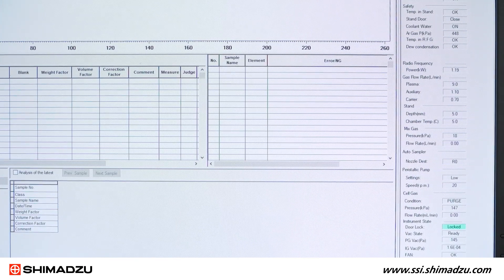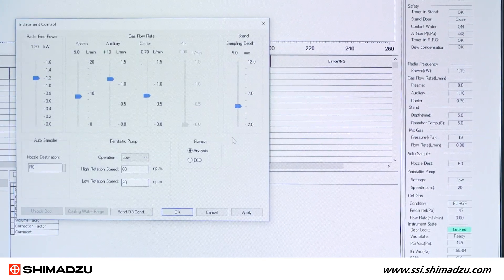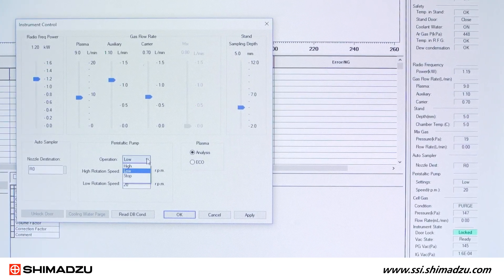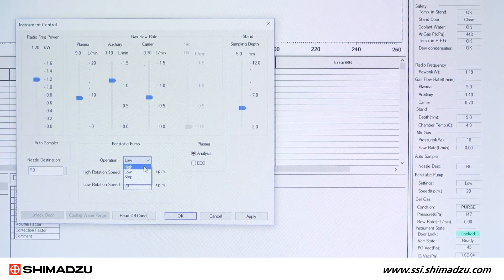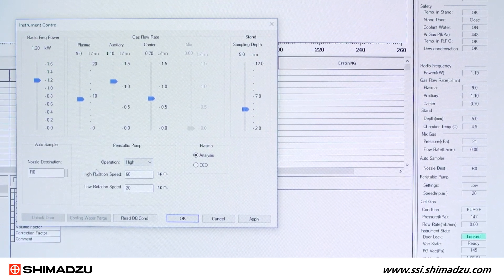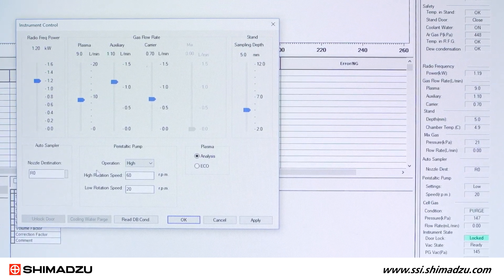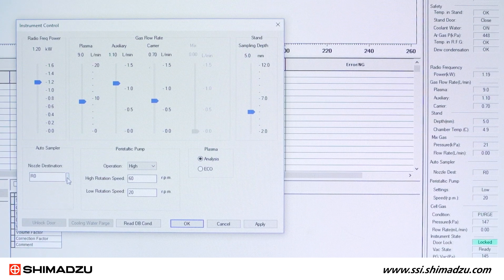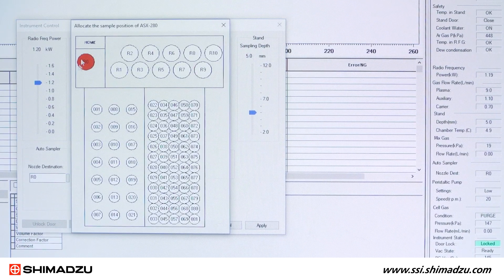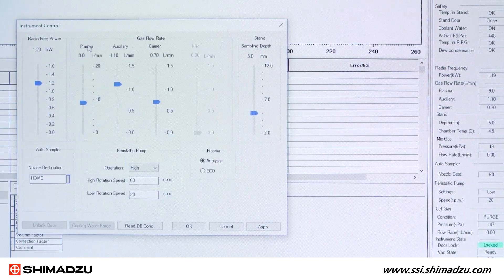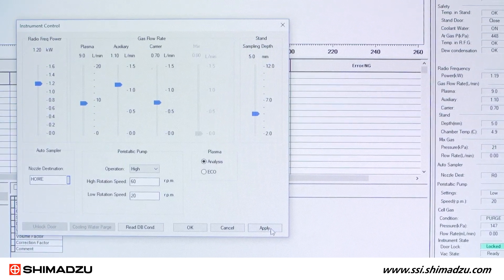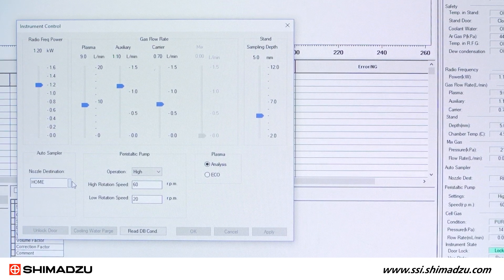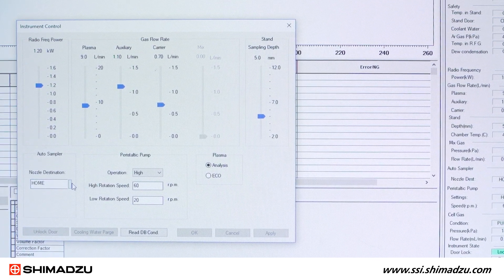In order to generate a bubble, first make sure the plasma is on. Then use the instrument drop-down menu and select Control to open the instrument control window. From the nozzle destination drop-down menu, select Home and click Apply to lift the sample tube out of the rinse port and introduce an air bubble in the sample tube.